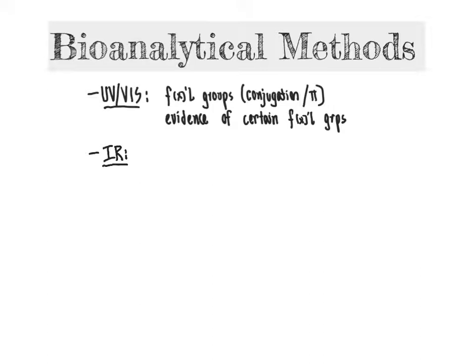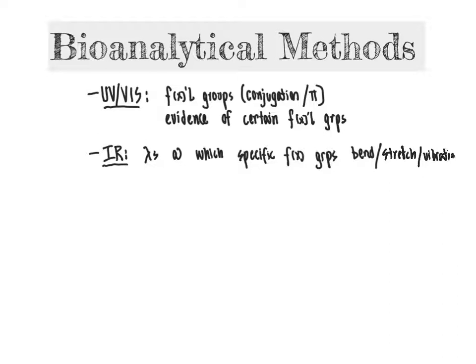So what we are looking at here is the wavelengths at which specific functional groups are going to be observed with bond bending, stretching, or vibrations.